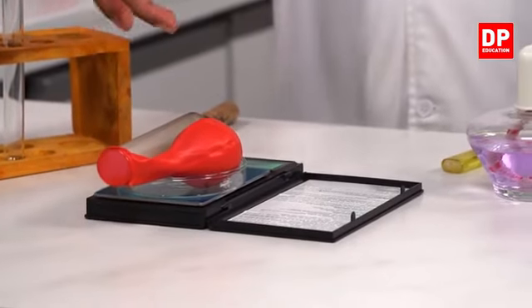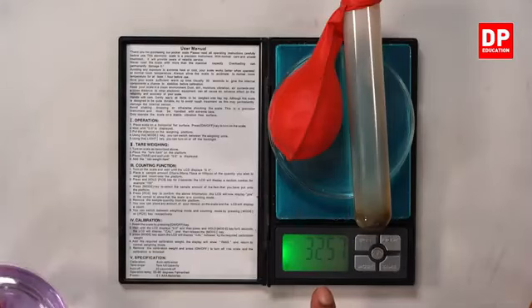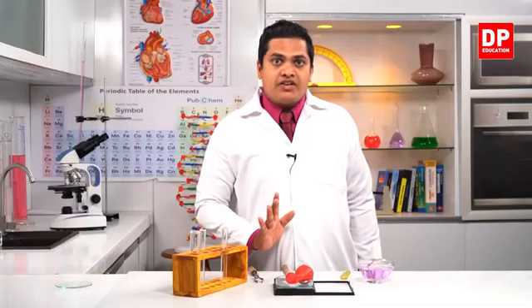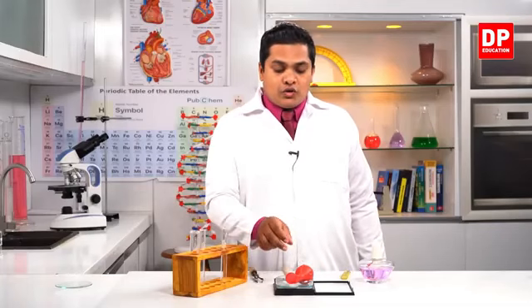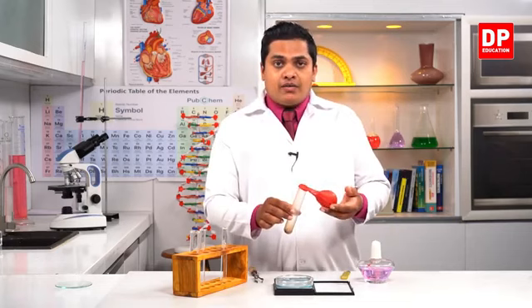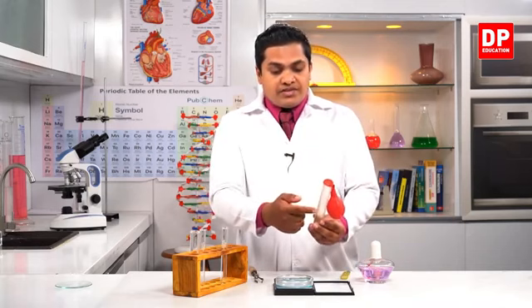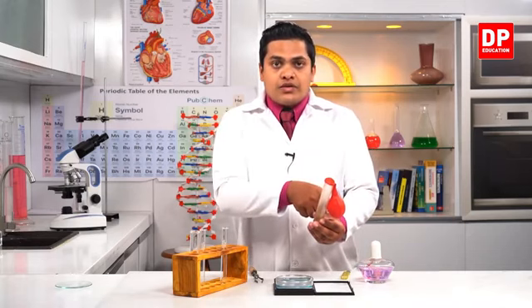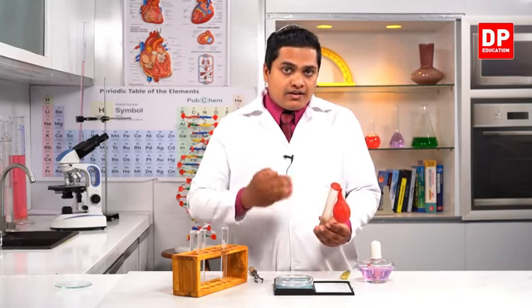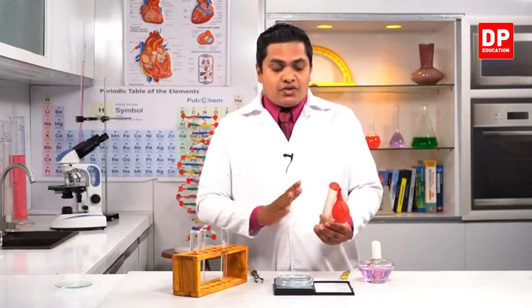All the smoke coming out from the reaction is being filled into the balloon, and the amount, see the amount, 32.57. So the mass hasn't changed this time. Why hasn't the mass changed this time? Because the gas, or the smoke, which is coming out from the system is now being filled into the balloon. So there is no mass which is getting released out from the system to our environment. No mass.